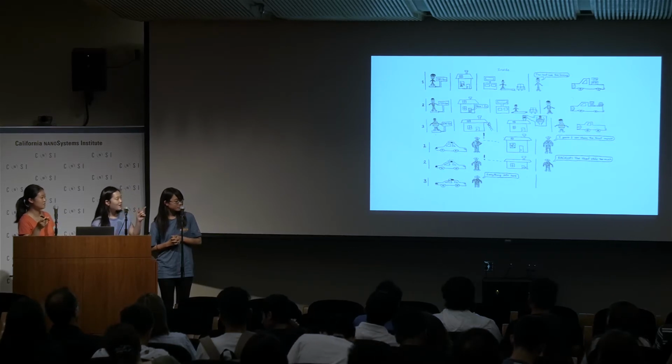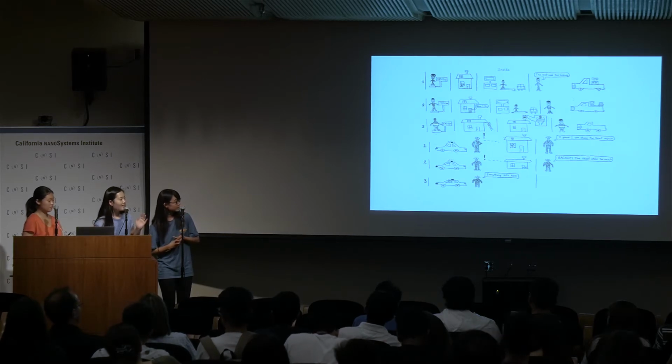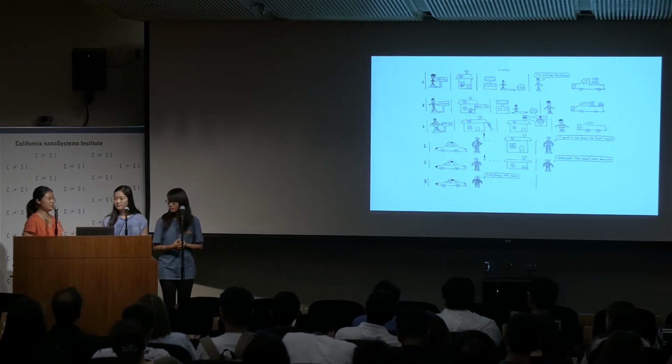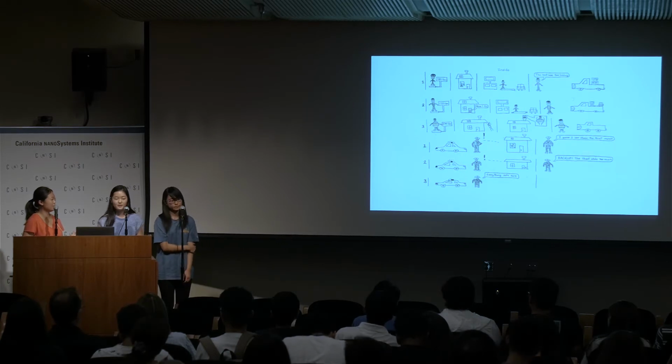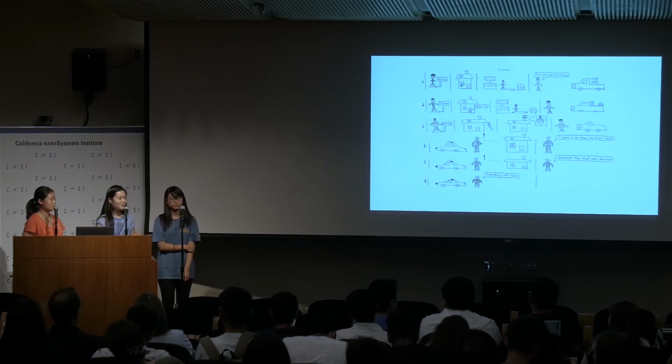And then the first robber, since the damage was only a little, he thinks that he can go after the robber himself. And in the last one, nothing happens, so the police doesn't need to go after them. So in our experiment, the more carbon dioxide that was produced, the more alive. No, the more carbon dioxide that was produced, that meant that the yeast cells weren't killed as fast. So the less carbon dioxide that was produced, the more the yeast cells were killed. An equal amount of liquid was pushed by the carbon dioxide, and the difference showed. That's what we measured.